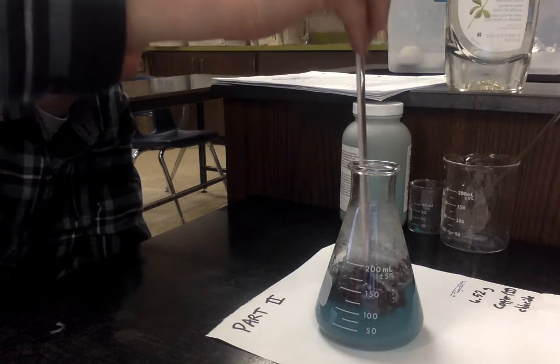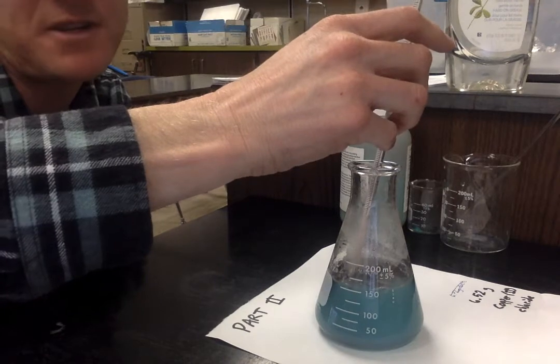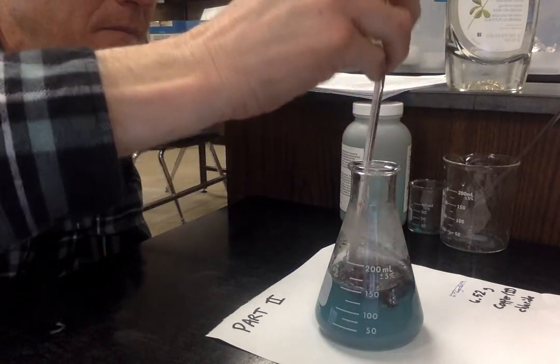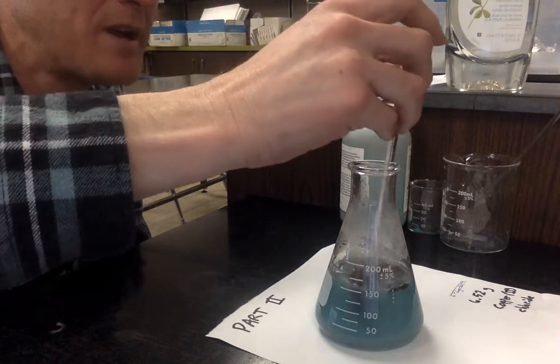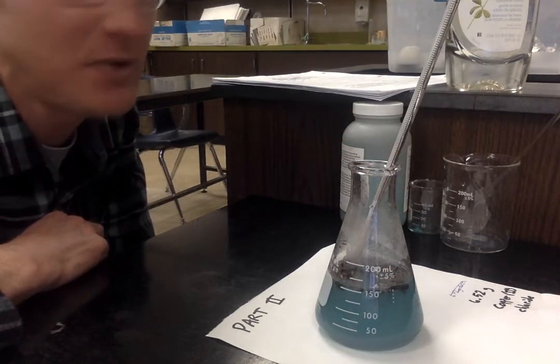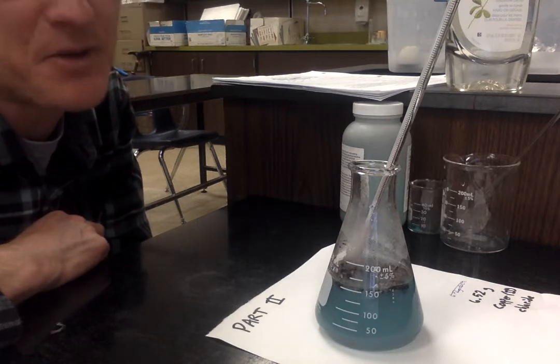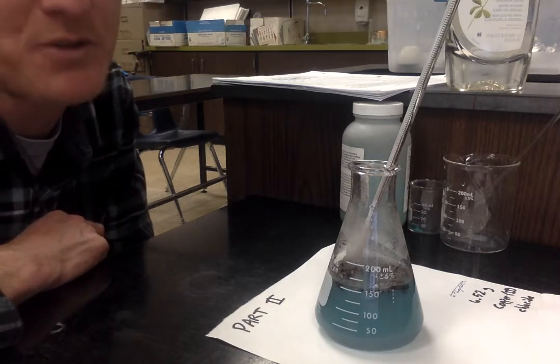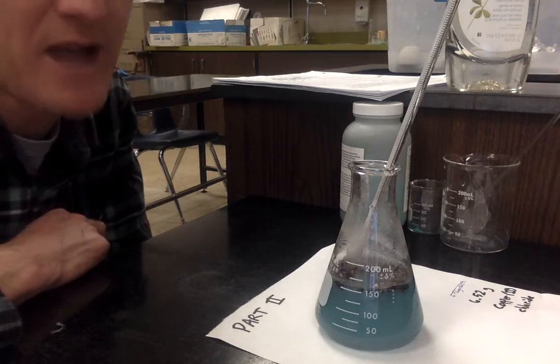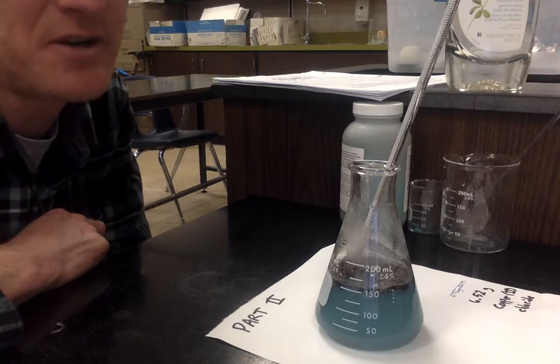I was hoping that we'd be able to, let's see, it's 26 minutes already. Well, I was hoping I'd be able to keep this video going long enough for the copper chloride to lose all its color. I can tell you from personal experience what probably won't surprise you, which is that if you leave this overnight, especially if I were to add more aluminum, eventually the blue disappears.